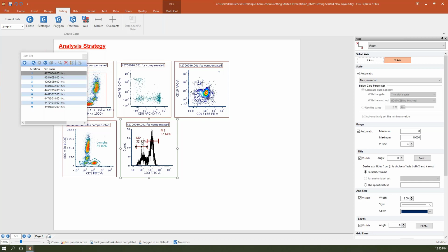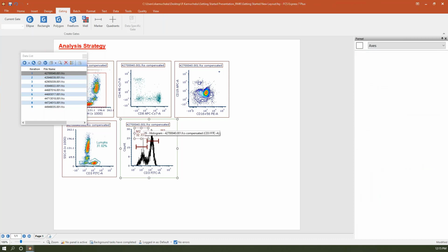There we go. And like I just showed there, one of my favorite features, because I'm always going back and forth with things, are my undo buttons. If you make a mistake and it doesn't go well, a quick undo will bring you right back to where you were before the thing happened. So just a really nice feature in case something goes wrong. It happens to me often.